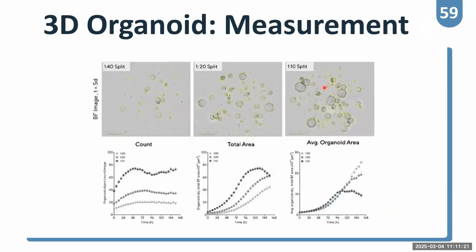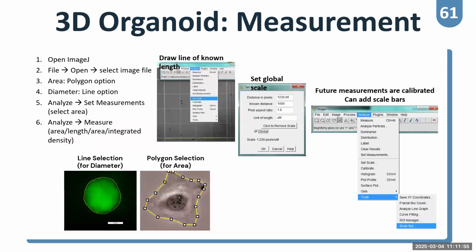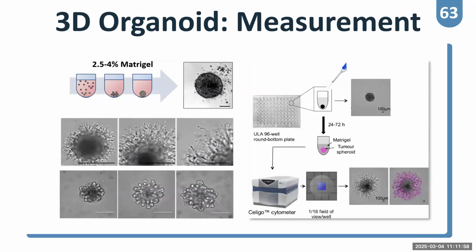So until now you have the AI. From now on we apply the AI, not measure manually. You can use the AI to measure the size, count the area, and also monitor time by time for you and plot the graph ready for you. You can use the AI to analyze the organoid formation for you, not use the manual image that I have already taught you.